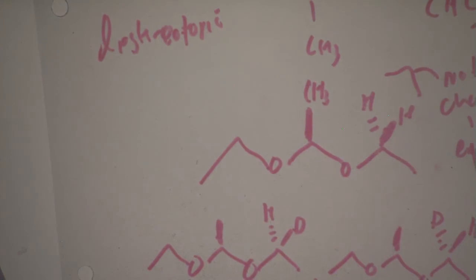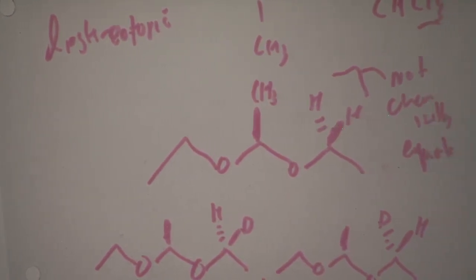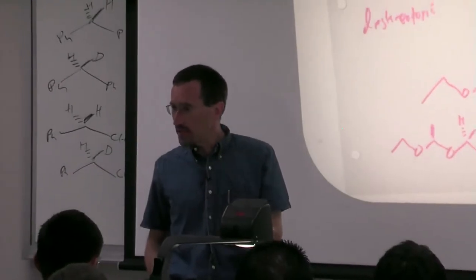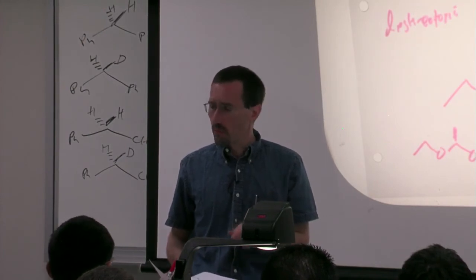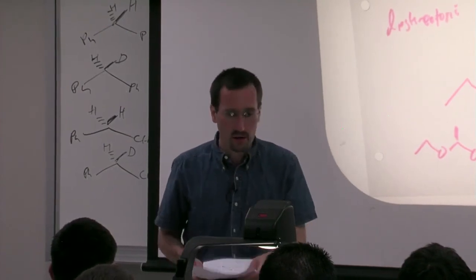We talked about in IR how if you have like an internal alkene, sometimes you don't see the stretching because there's like that pseudo-symmetry. Do you see the same thing with this, that if you have like a stereoisomer or like a stereocenter, but it's like really far away? Absolutely. Great question. Just because 2 protons are topologically diastereotopic doesn't mean that they won't be coincident. And in general, the further that they are from the stereocenter, the more likely they are to be coincident and behave as if they are equivalent.